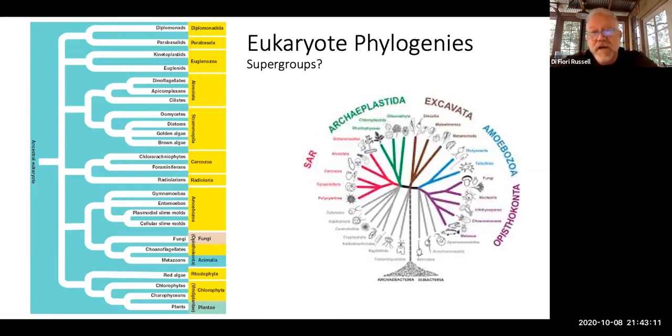Hard to say. Depending on where you look it up, if you find a Euglena and type that into Wikipedia, you may get a totally different phyla name. So don't worry, if I ever mark something wrong or take off some points because of your taxonomic delineations, if I ask you about it, just show me where you got the info. I understand there are many, many different alternatives.